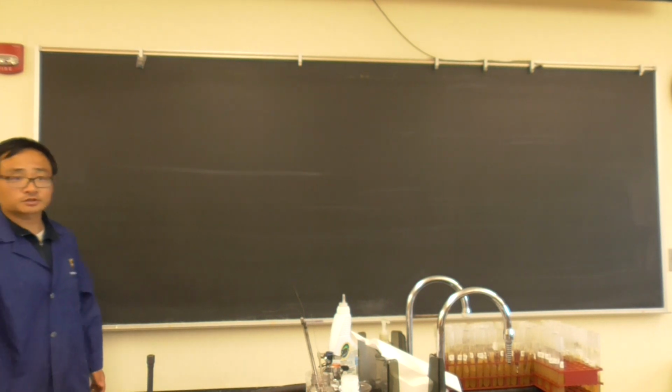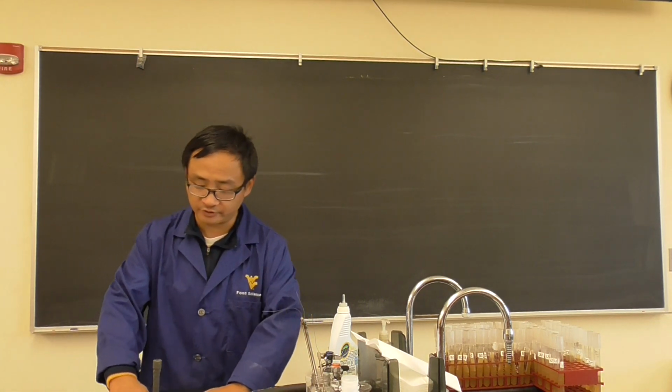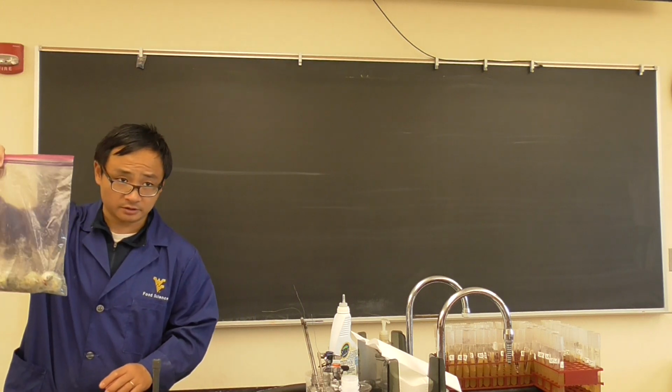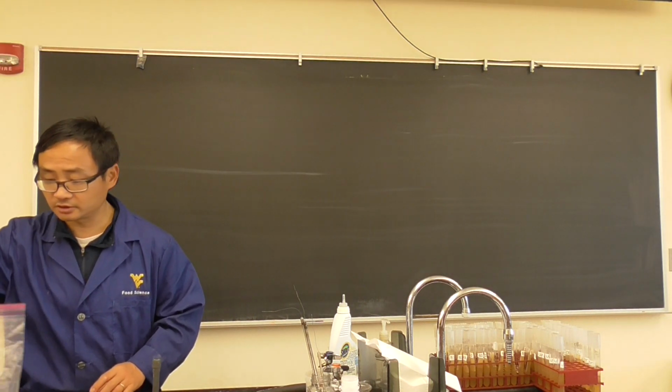Okay, let's have a class. So, you have Staphylococcus aureus, Streptococcus from your throat. Is that right? Yeah, some will find it. That's why I told you it's a very exciting material. Today we have a more exciting material right here, okay? But we're going to talk about this later on.